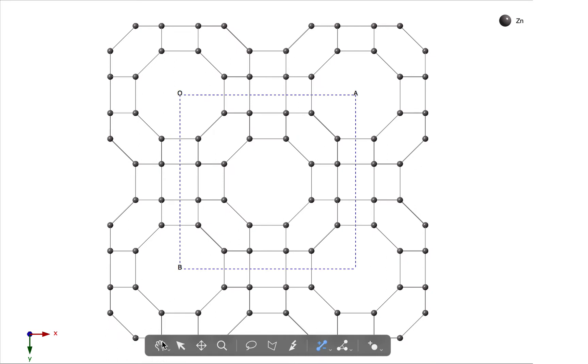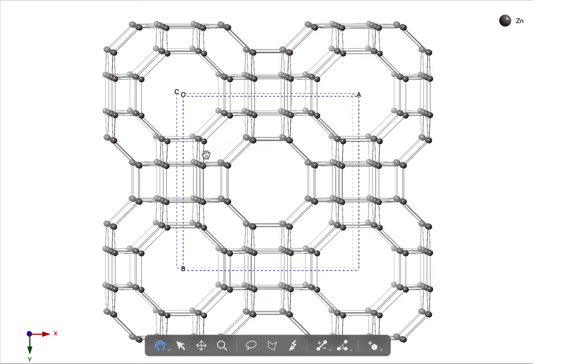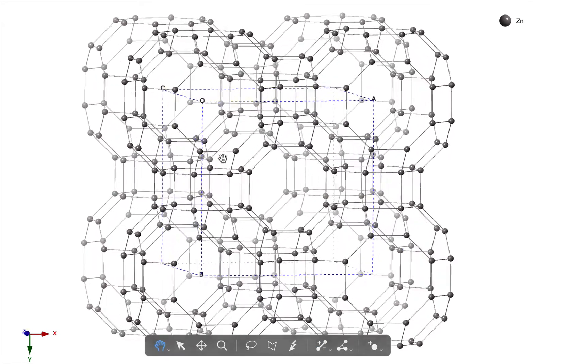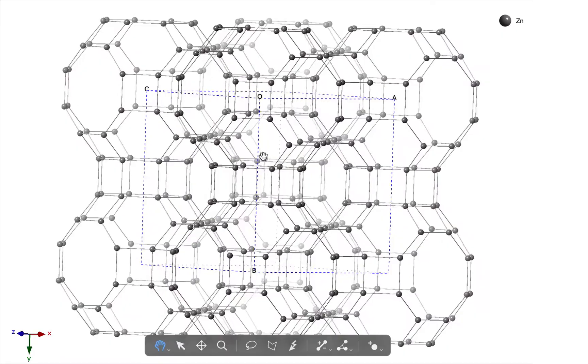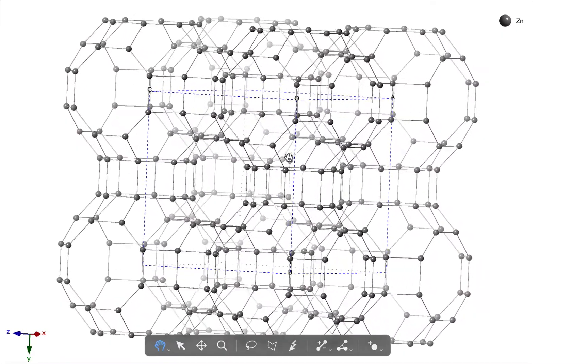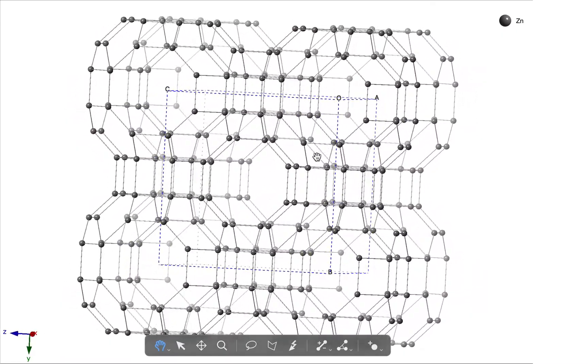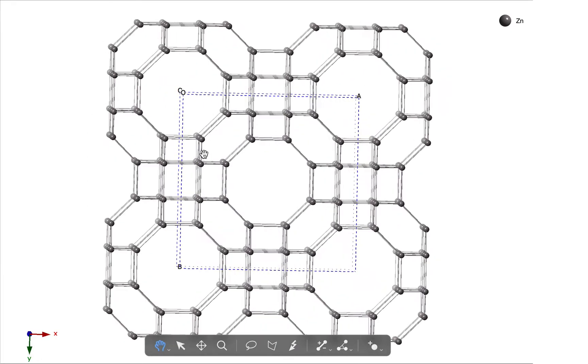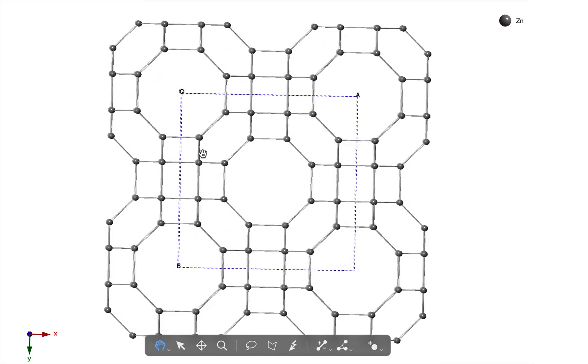If we click and drag with the mouse to rotate this, you can see that we have these very large cages together with connectors between them. So we want to represent these using large polyhedra.